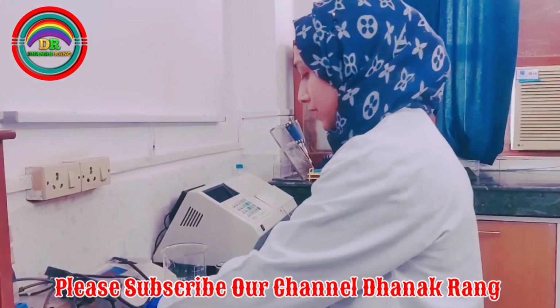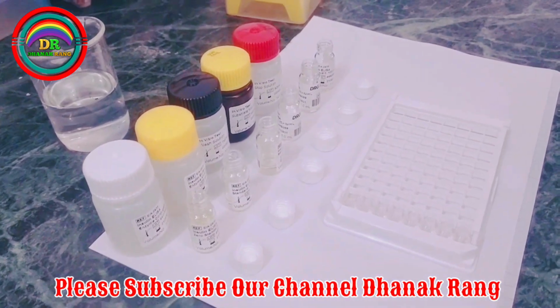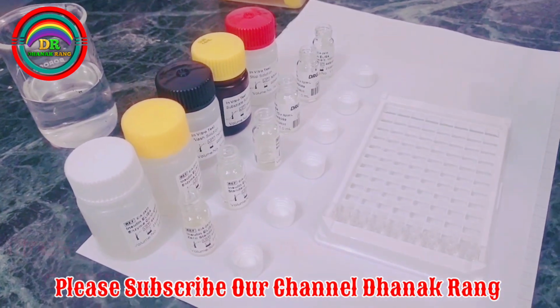So the first step is to add the standards or the sample, 25 microliters in each well.